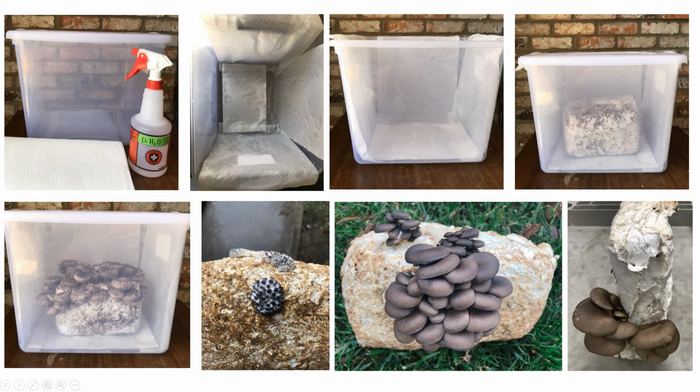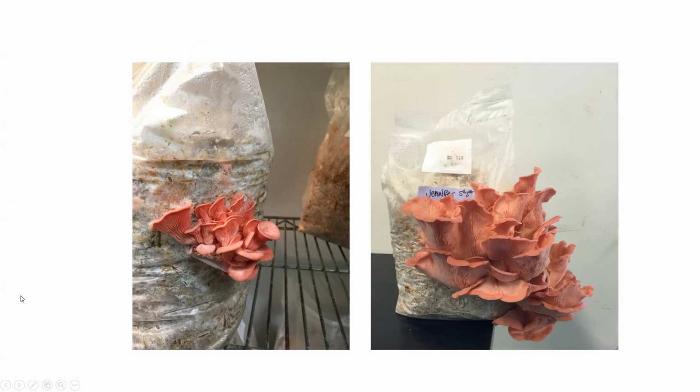I also just fruited this blue oyster. I fruited it outside. I left this oyster in my backyard, and it just fruited. This is another gray oyster that I put in my backyard, and it fruits. This block was on my lab bench top, so I left it there, forgot about it, and it started fruiting. So oyster is very forgiving. See, this pink oyster here was left on the lab bench as well, and you can see there was an X here, and the oyster came out from it, and it just grew over time.